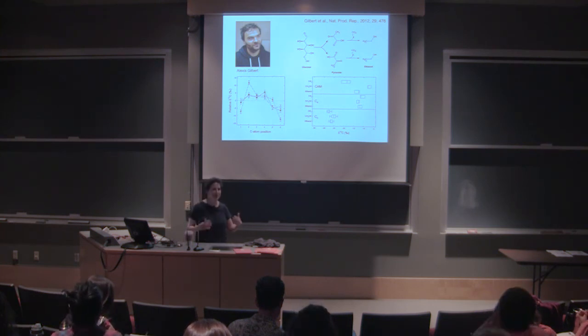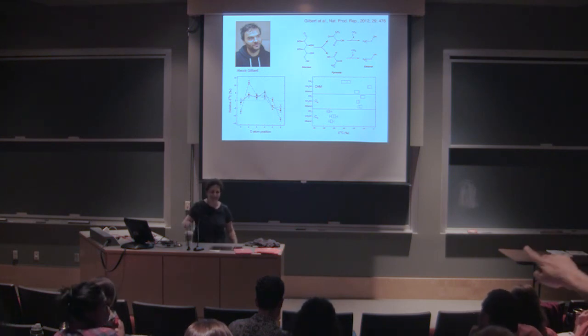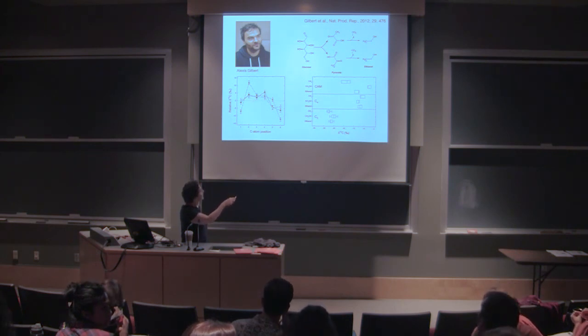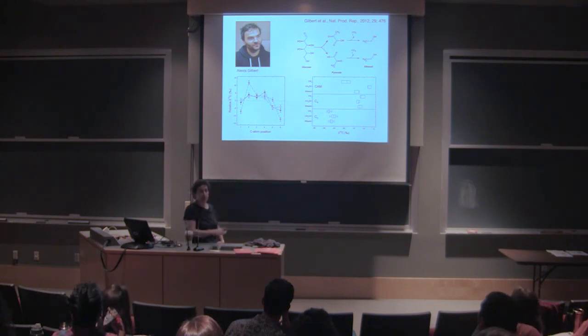So to me, that's good news for us natural science types, because that means instruments might get pushed forward in a useful and affordable way. Yeah. So the way that they're breaking down glucose to pyruvate and then to ethanol again? Yeah. So for this specific compound, the machine that they're using, it's all front-end work you have to do to break down the compound. Some of this is the pyrolysis approach, and that's what he's worked on quite a bit.